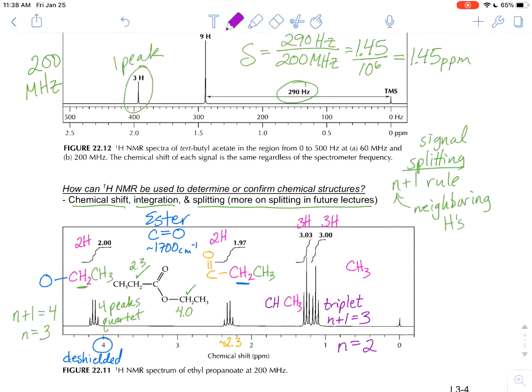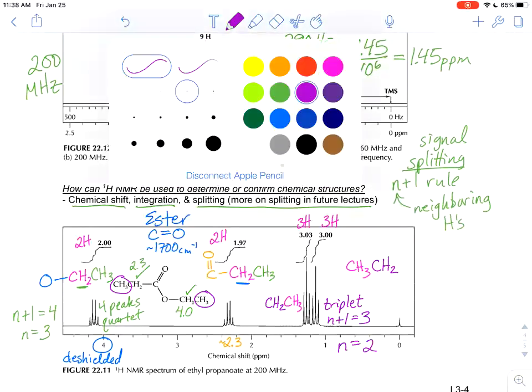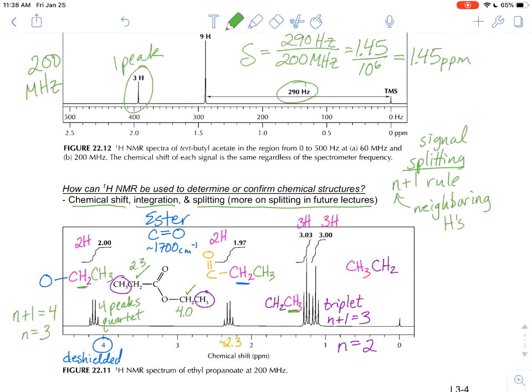So each of these methyl groups are connected to CH2 groups, which is what we actually see in the known compound, which is why it's useful to learn knowing the actual answer. These are 2 CH3 groups. They have a very small difference in chemical shift. You can see this one here is a bit more de-shielded, and that is likely because that one is closer to the oxygen, which means it's going to be more de-shielded. This one is farther from the oxygen, which means that it is the one that is closer to the carbonyl.